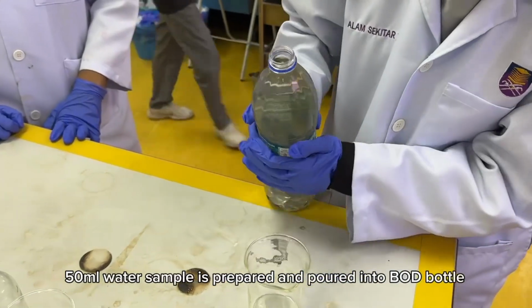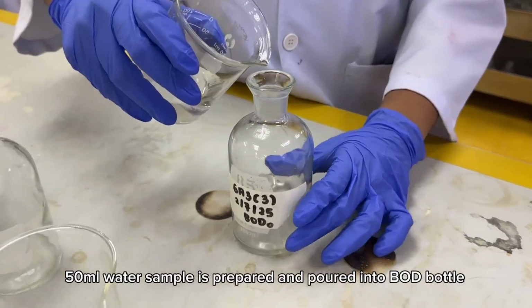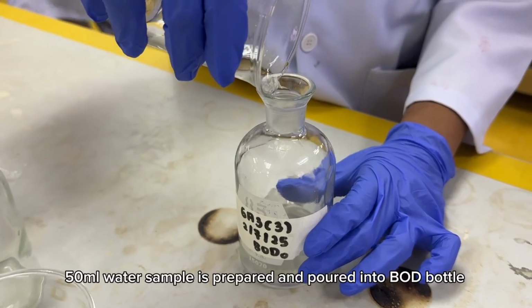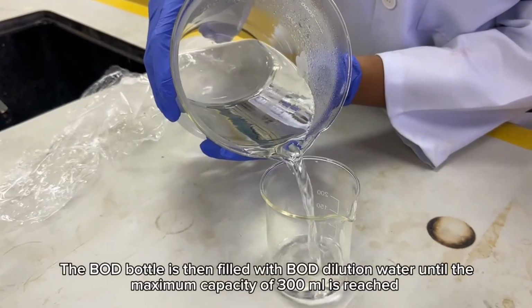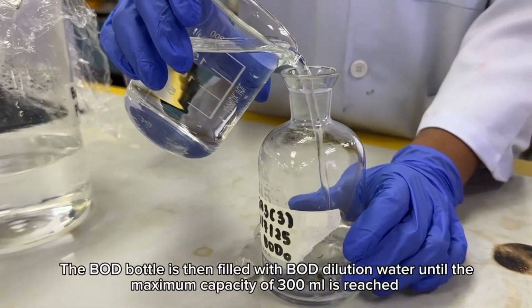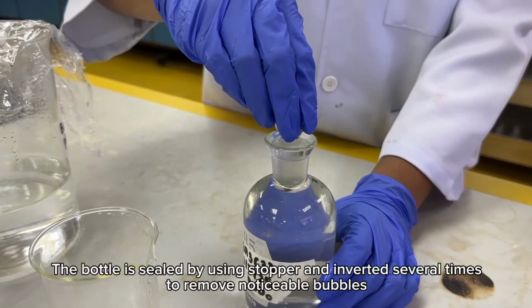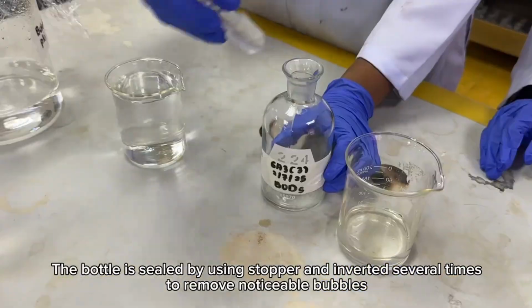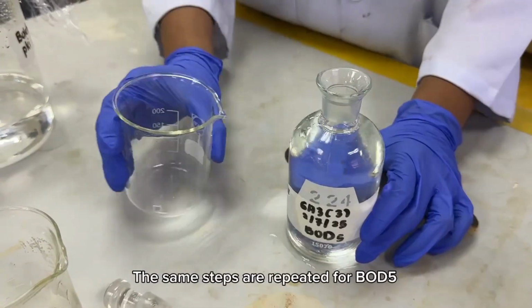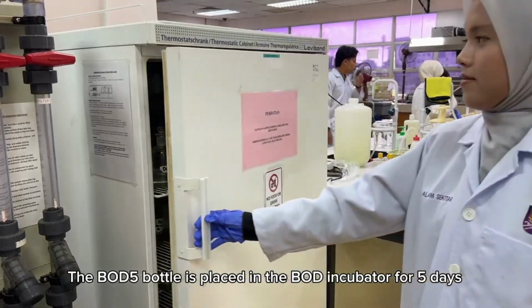A 50 milliliters water sample is prepared and poured into the BOD bottle. The BOD bottle is then filled with BOD dilution water until the maximum capacity of 300 milliliters is reached. The bottle is sealed using a stopper and inverted several times to remove noticeable bubbles. The same steps are repeated for BOD5. The BOD5 bottle is placed in the BOD incubator for 5 days.